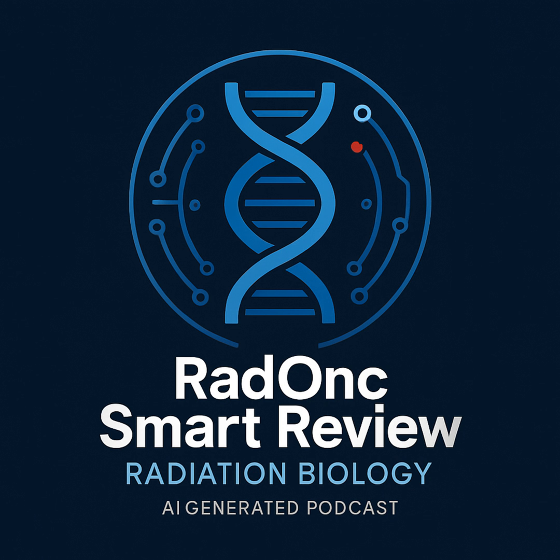How? Depends on the reporter. For luciferase, you lyse the cells, add luciferin, and measure light output. For GFP, you might measure fluorescence intensity with a plate reader or flow cytometer. And if the signal goes up after treatment, it means your regulatory sequence was activated. Precisely. More light, more fluorescence means the promoter or enhancer became more active, driving more reporter expression. If the signal goes down, it was repressed. It's a functional readout of regulatory element activity. Very useful for testing hypotheses about gene control.